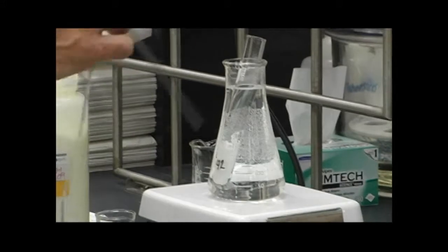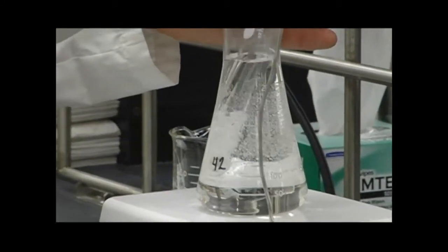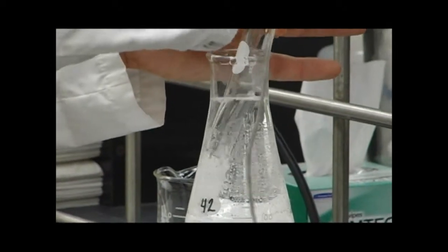See that the lauric acid has started to melt, and I could begin with the thermometer, giving it a little stir so it melts a little bit quicker.